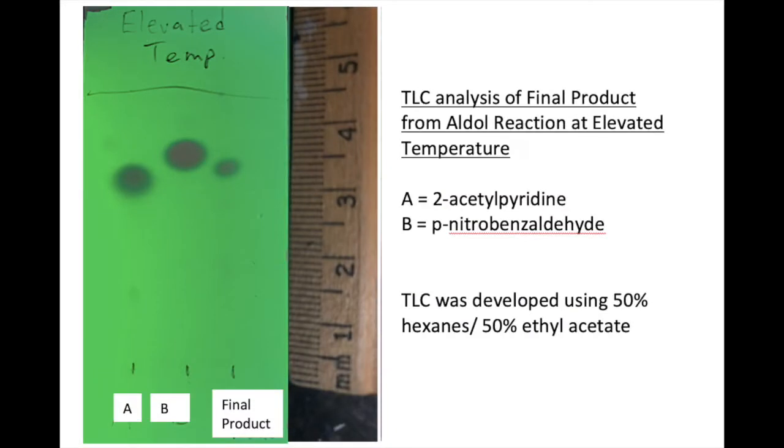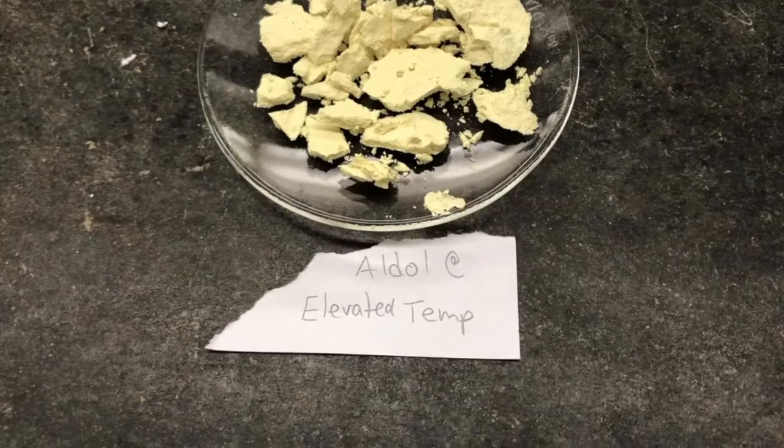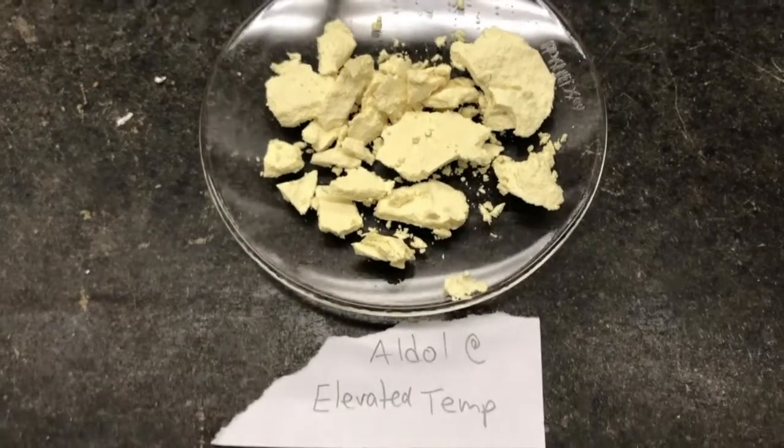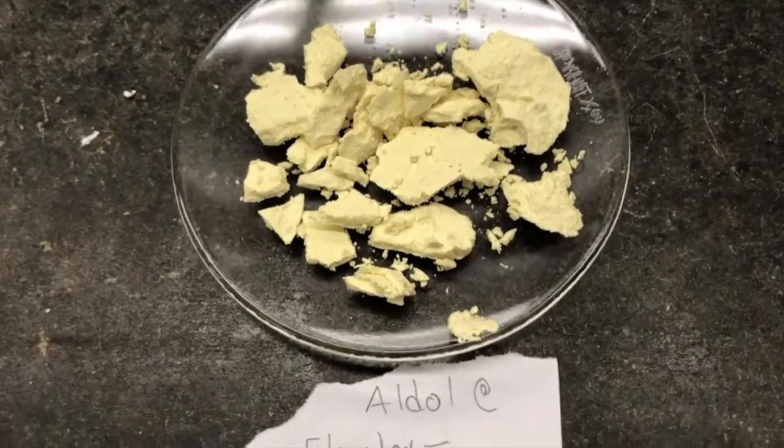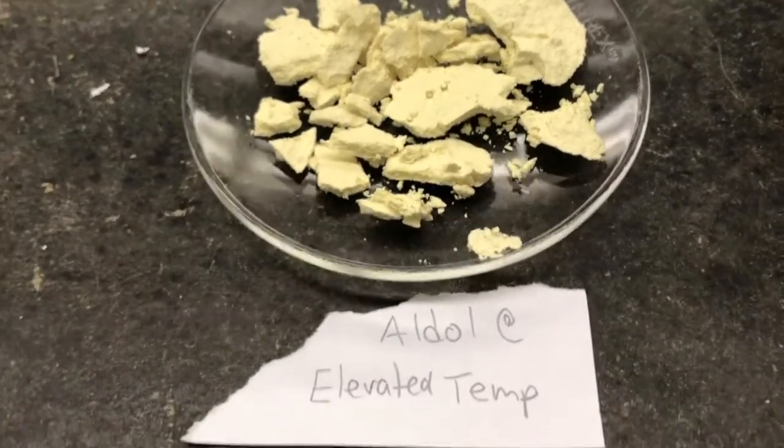So while our product kept drying, we took one last TLC plate of our final product. On this TLC plate, you can clearly see that the starting materials are different than the product that we isolated. But to confirm that, we're going to use melting point as well as IR. Here's what the reaction product looked like after we let the product dry for a few days.